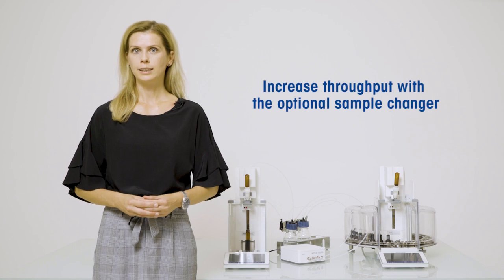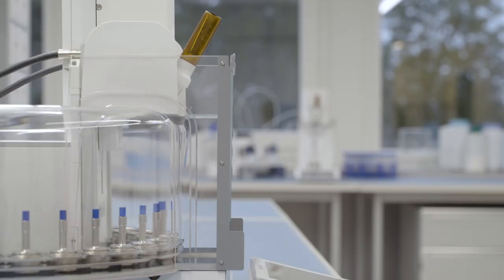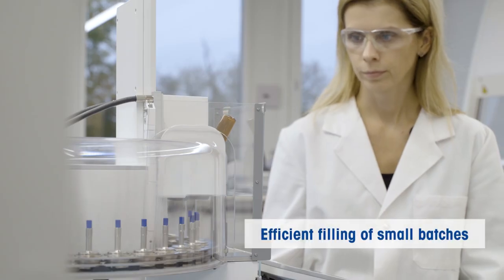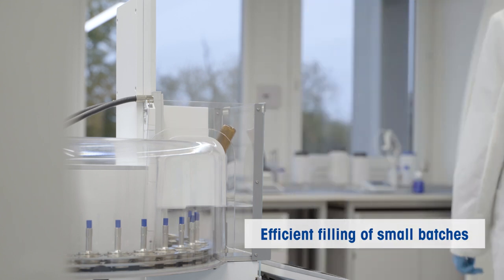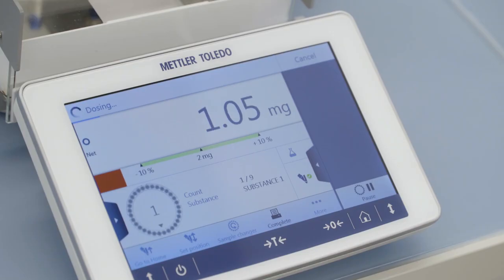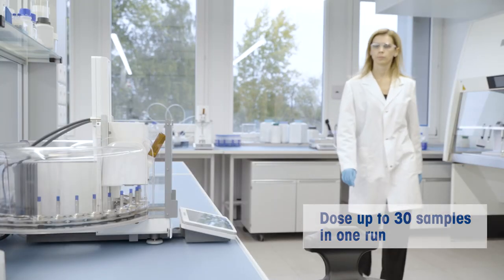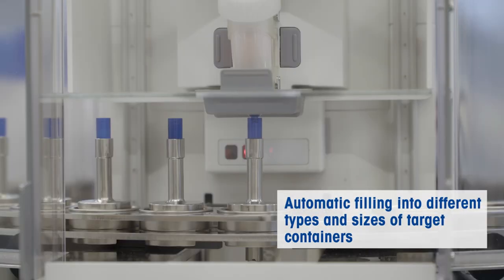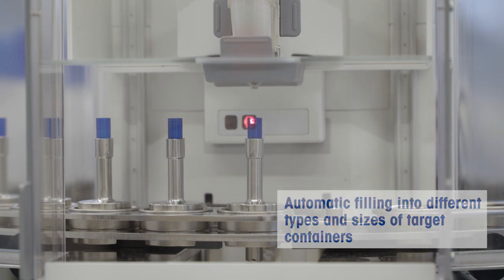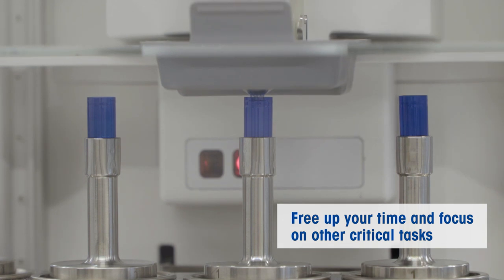In order to increase throughput, it is possible to extend the XPR Automatic Balance with a sample changer. This is an ideal partner for filling small batches, and this highly flexible setup enables you to dose up to 30 samples in one run. Different sized containers as well as capsules and vials can be filled quickly and automatically. Not only do you benefit from highly accurate, reproducible, fast and safe dispensing, but you have more time available to focus on other critical tasks.